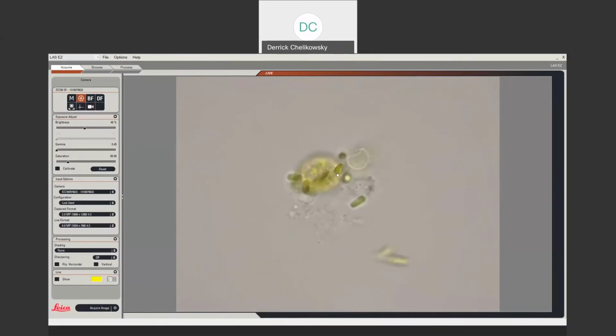Here's a group here. Mostly dead cells. I don't see anything with a flagella on it. That's unfortunate. Even the big one here, the big one's actually still alive. You can see movement inside the cell. That's actually really cool to look at. You can see inside the organelles working right here and right in there.